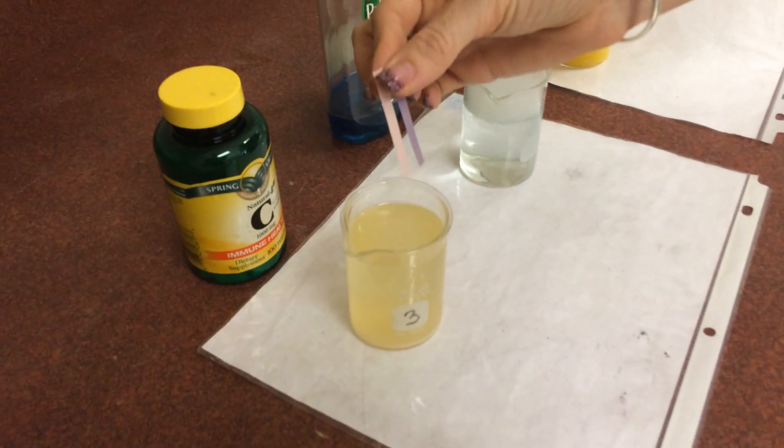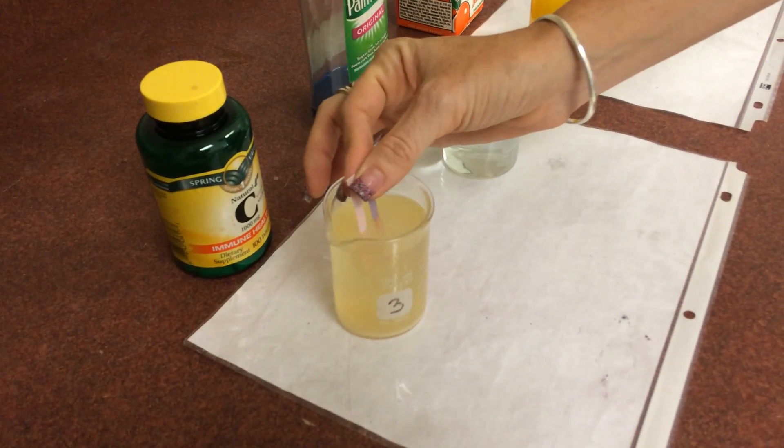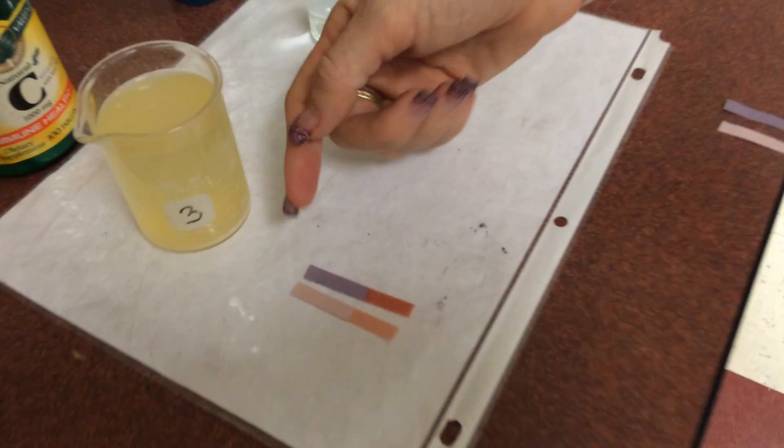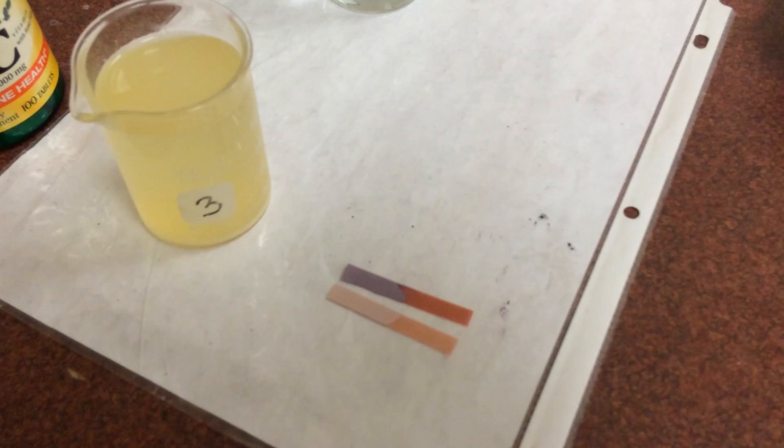Here we have some vitamin C - pirates' favorite vitamin. If we dip our litmus paper in here, we get red and red. So vitamin C is an acid.